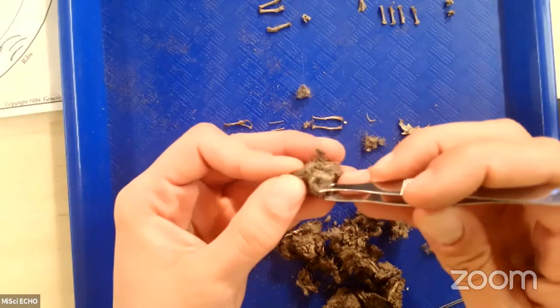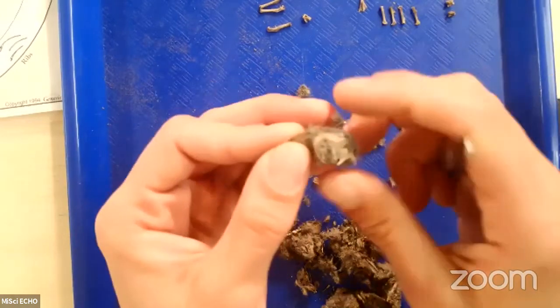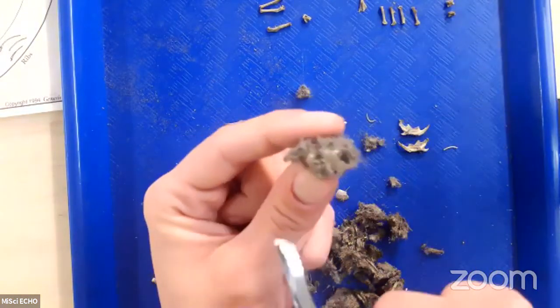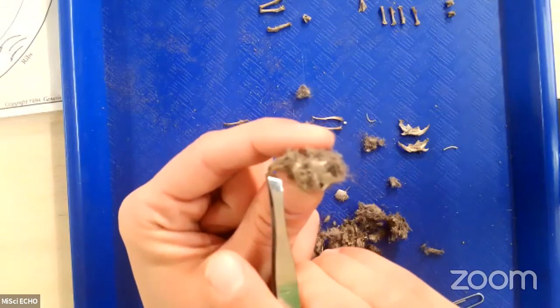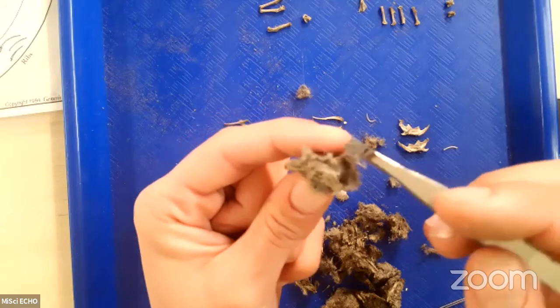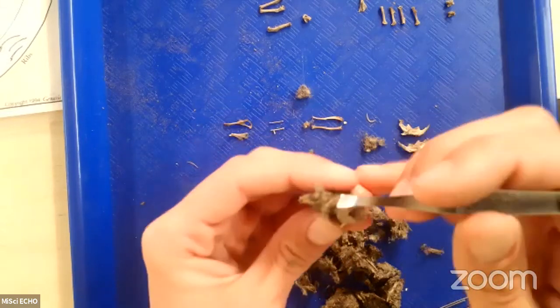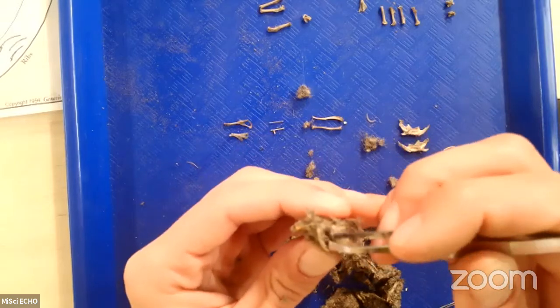This can be really complicated and it takes a lot of time, but what I'm working on right now seems like a skull. So where my fingers were right over here seems like the top tooth. And they seem to be attached to this larger structure, which seems like the cranial side of the skull of this animal.